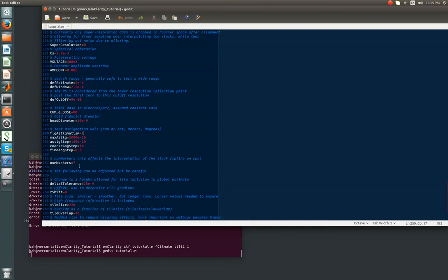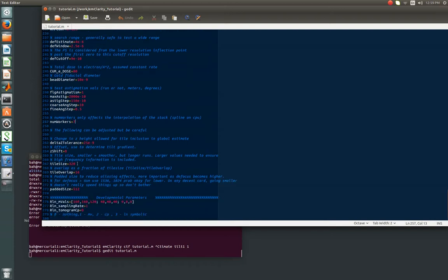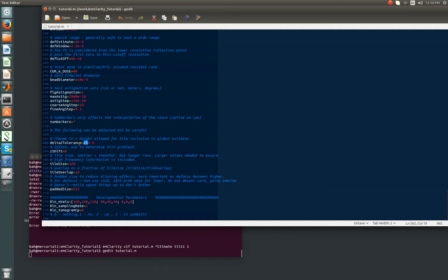The number of workers only specifies in this case when you're interpolating, so we use a spline-based interpolation kernel. The delta-z tolerance is, in our case, 25 to 50 nanometers typically. That's the change in anticipated defocus that you allow into the averaging, and this usually gives very good results. If you have really low signal-to-noise data, like you're working with thick cells, you may want to increase this, which will give you a lower resolution estimate, but it will give you more power in the signal, which is what you would want for that situation anyhow.